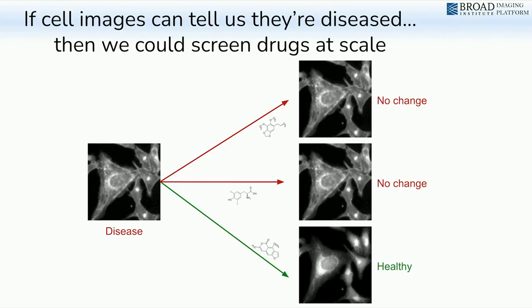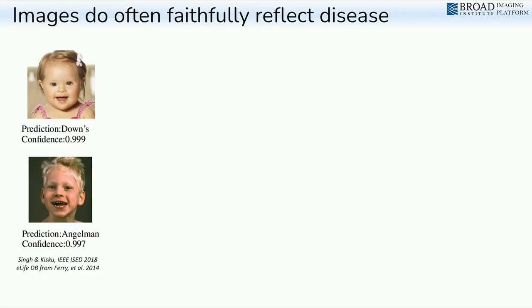So very similar to what we heard yesterday about using Tahoe's data for mRNA profiling. This is the same concept, and other companies like Celerity were based from the beginning on this mRNA profile reversal, but now we're seeing, can we do this with images?